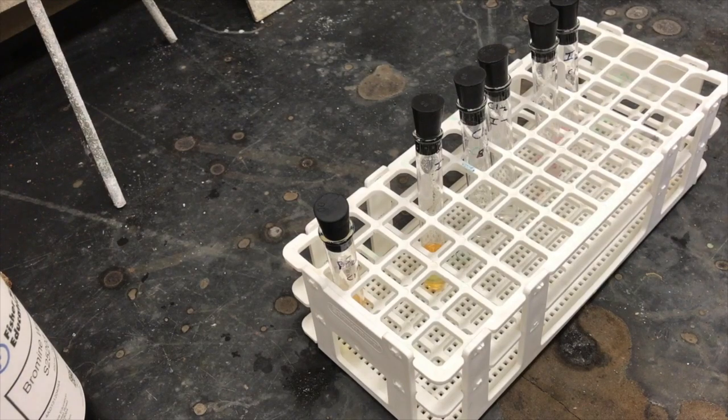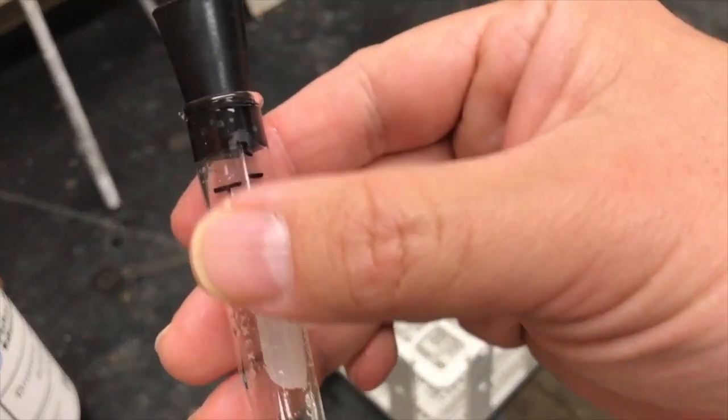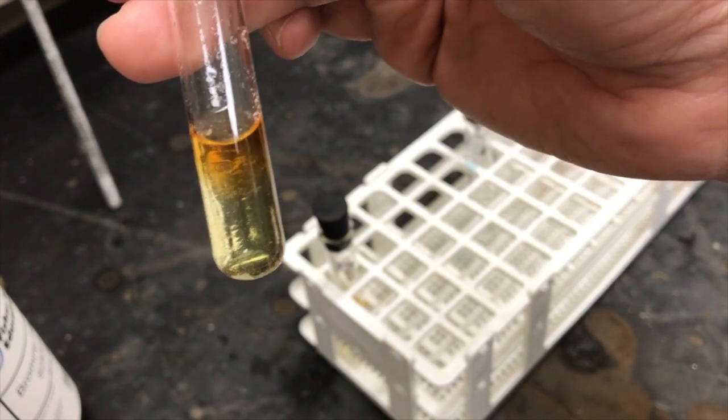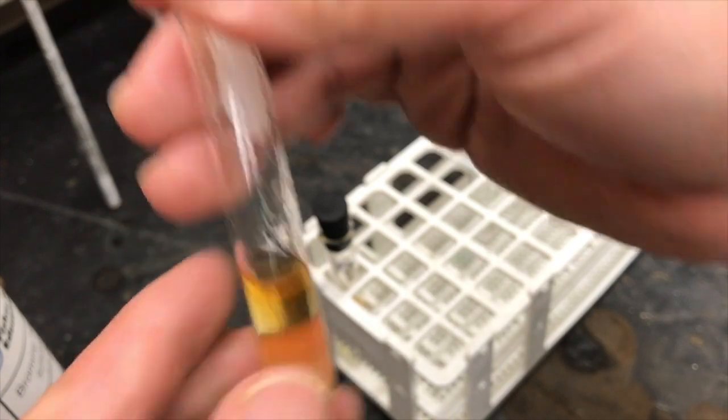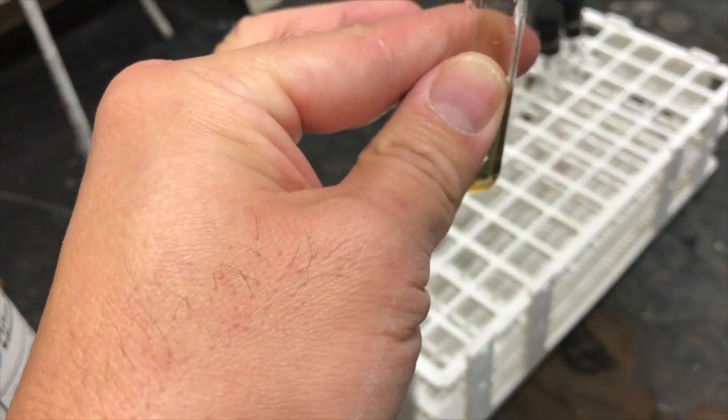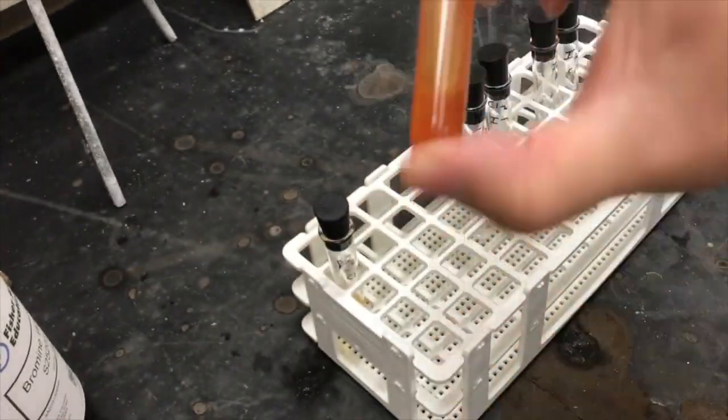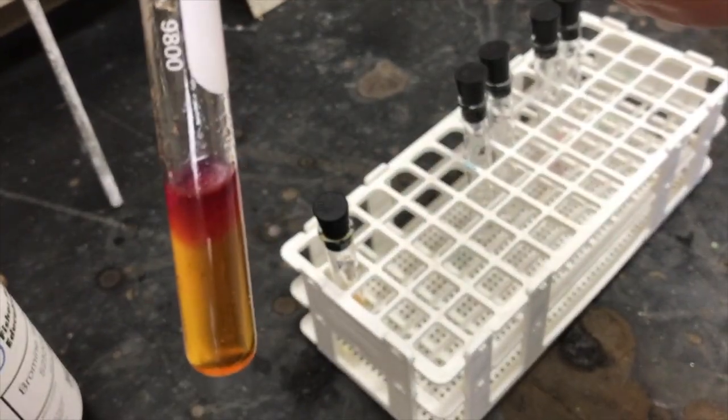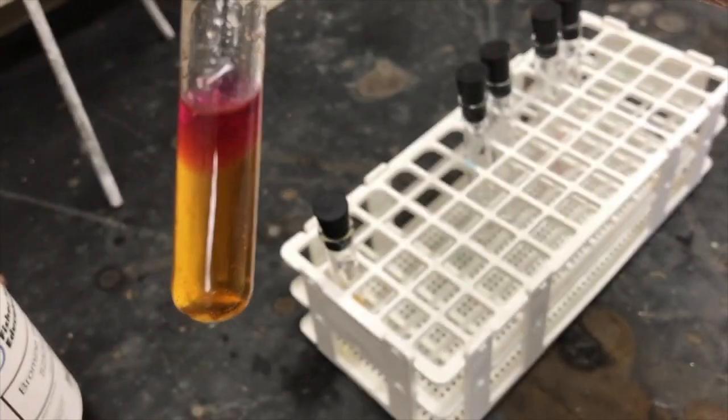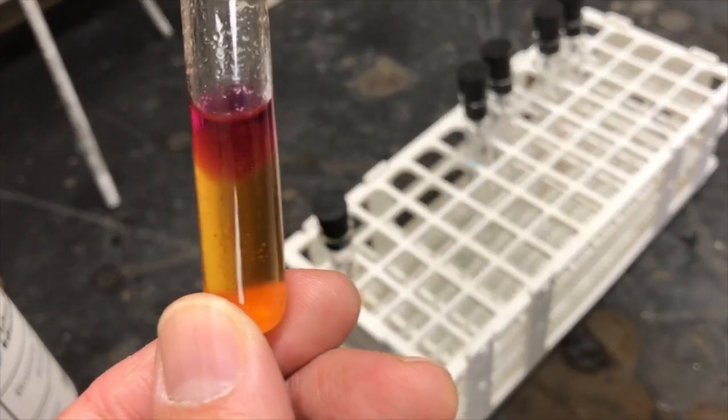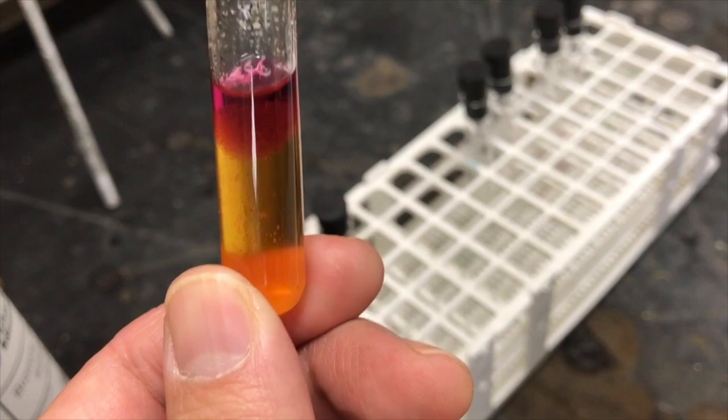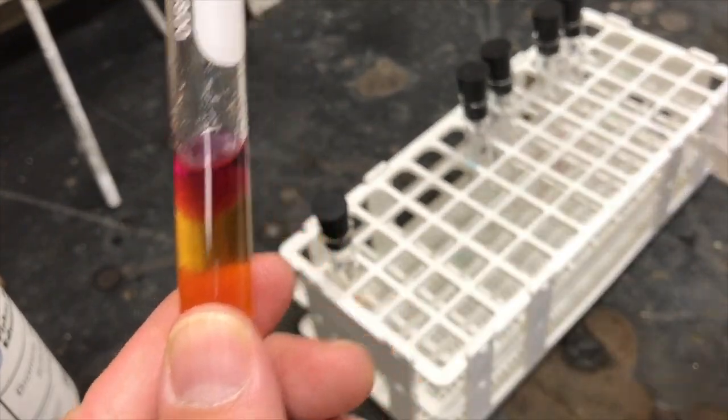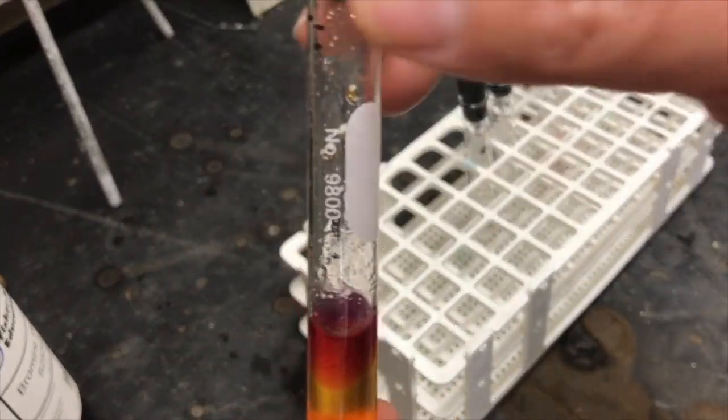Next we're going to try the bromine with sodium iodide. Again two layers because there's a hexane layer and an aqueous layer. And there's a change we now see pink layer on top in the hexane layer there's pink and we see kind of an orangish aqueous layer on the bottom. So again this was sodium iodide with aqueous bromine.